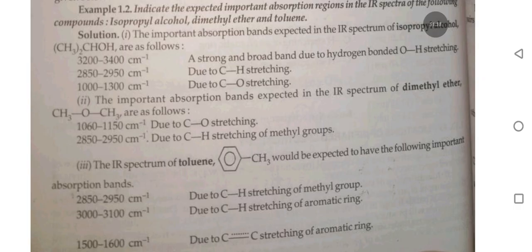Important absorption bands expected in the IR spectrum of isopropyl alcohol are as follows: 3200 to 3400 cm inverse, a strong and broad band due to hydrogen bonded OH stretching. 2850 to 2950 cm inverse due to CH stretching. 1000 to 1300 cm inverse due to CO stretching.